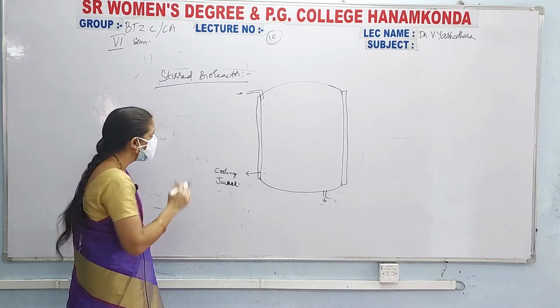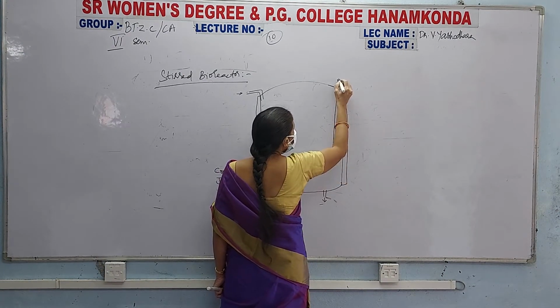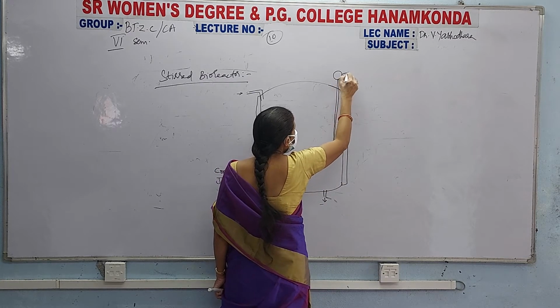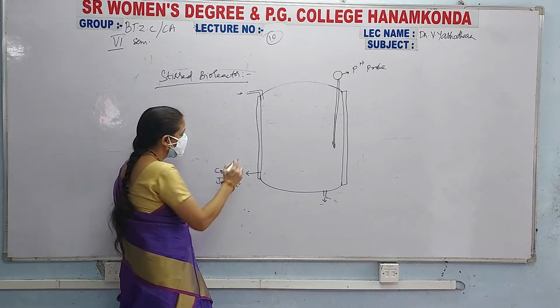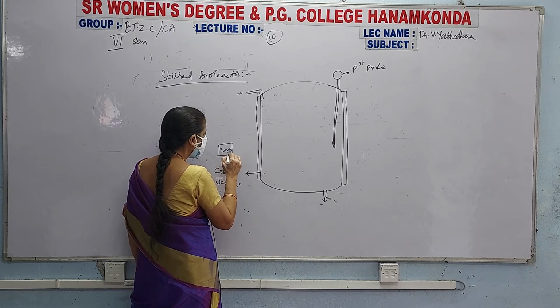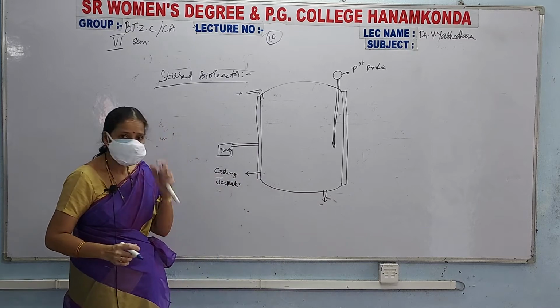Not only that, it is equipped with a pH probe. Now it is equipped with a temperature regulator.